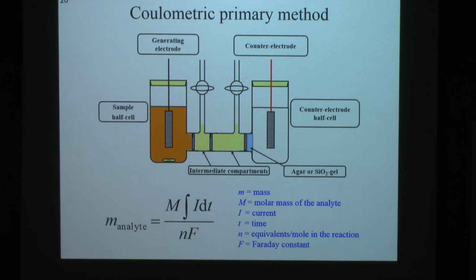Anyway, so that's coulometry. Coulometry has the advantage that it is the most accurate chemical analysis technique known. You can perform analyses that are good to parts in 100,000. In fact, Jason Waters just did some analyses of one of the primary substances, benzoic acid. And benzoic acid you can make in very high purity if you do it right, and if you have good material, you can determine it to within a few parts in 100,000. That's like measuring the distance from here to Washington with an accuracy of less than the distance from here to the other end of the room here.